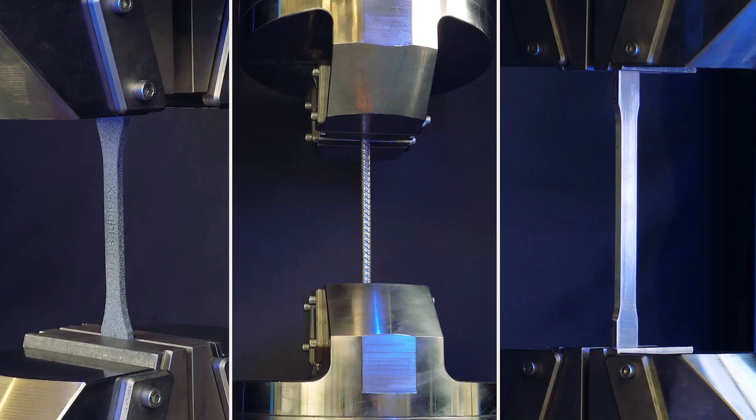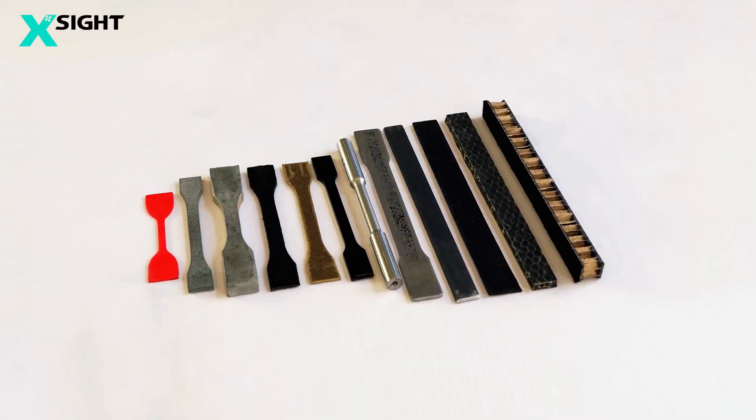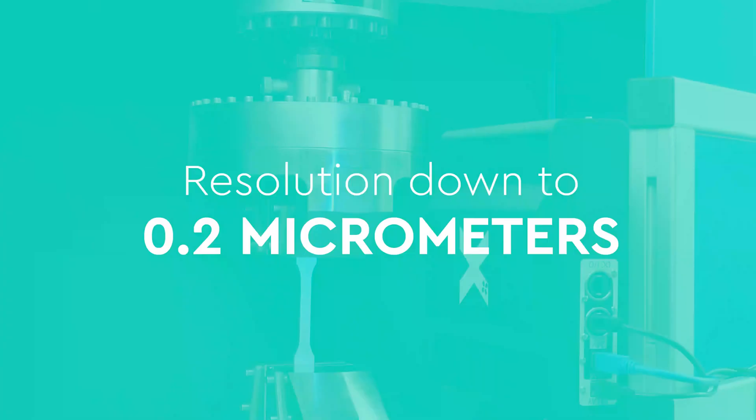2000's versatility has no limits regarding test type and temperature. 2000 can measure metals, plastics, composites, and many others.